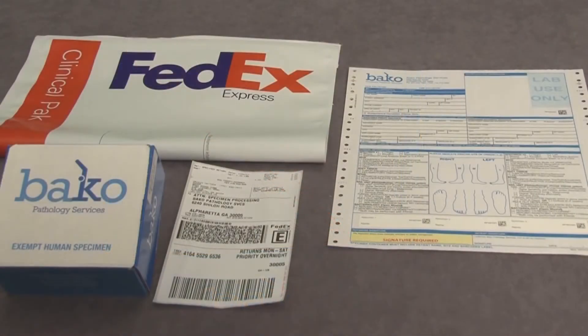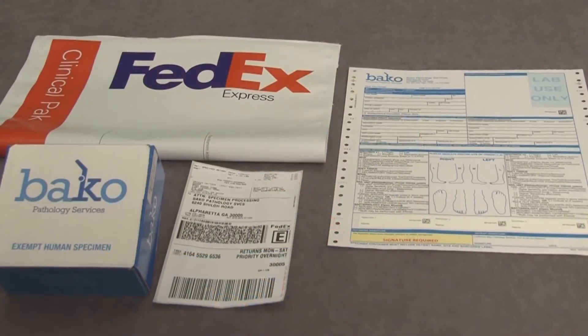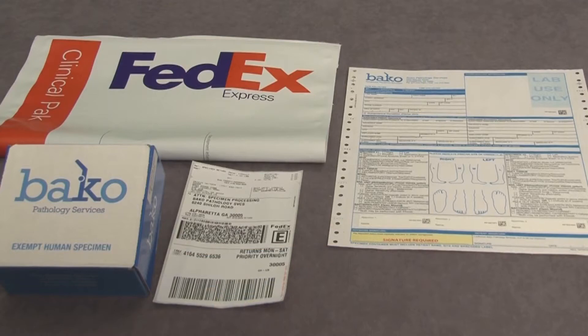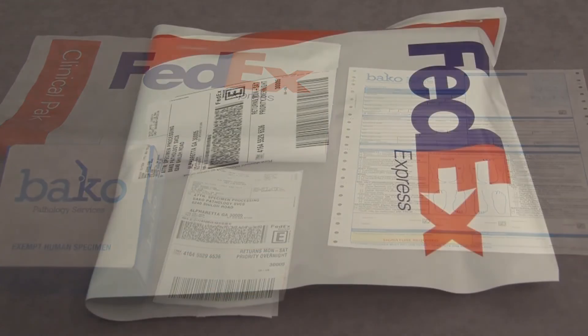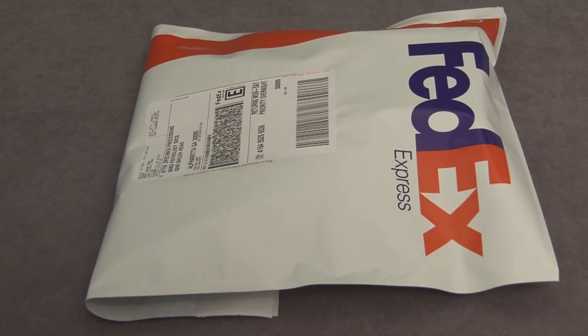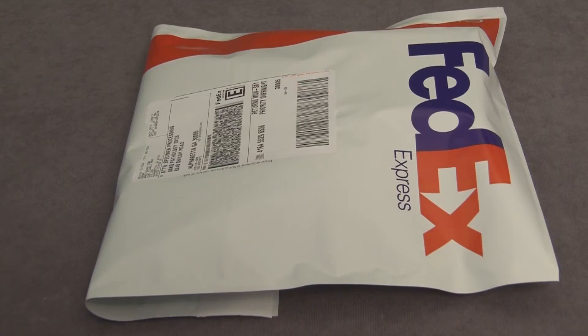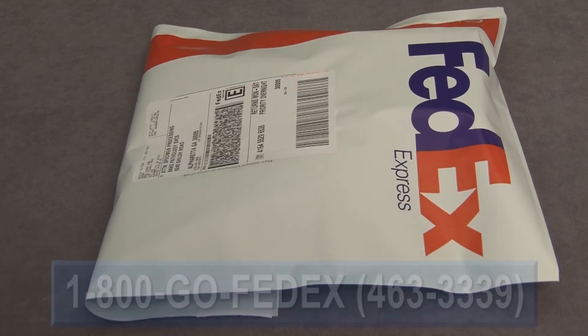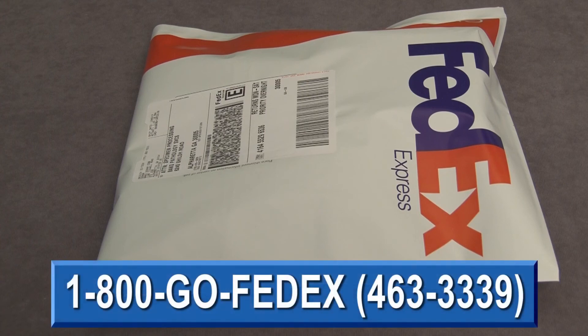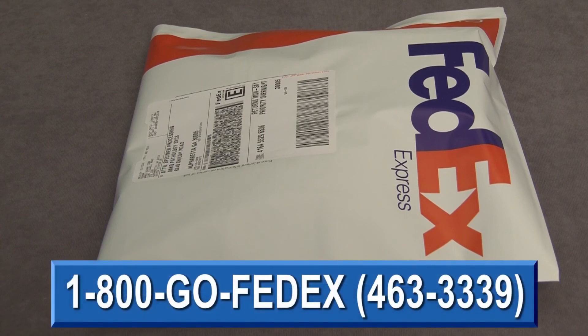Place the specimens into the overnight FedEx bag along with the filled out requisitions. Be sure to attach the FedEx shipping label to the bag. Record the tracking number and call 1-800-GO-FEDEX to arrange pickup.